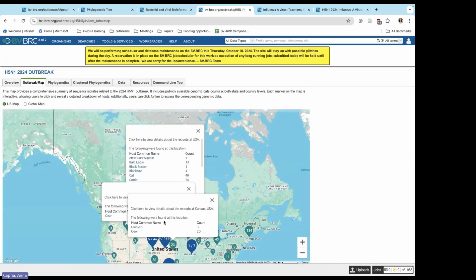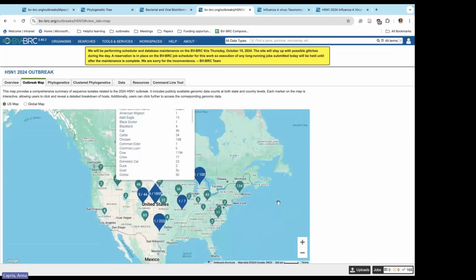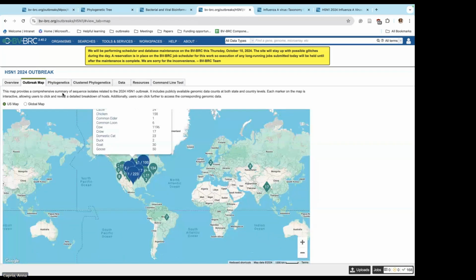The one in the middle is all of the US. So you can click here to get all of the country level data. That will always be a diamond. So we saw with Germany, we have the diamond shape for that country level data.